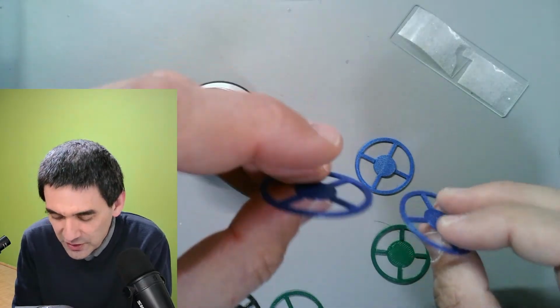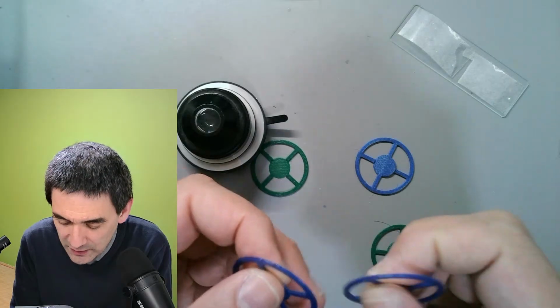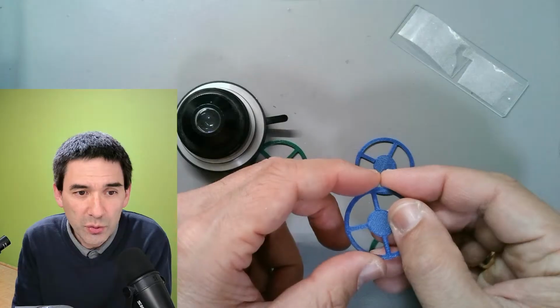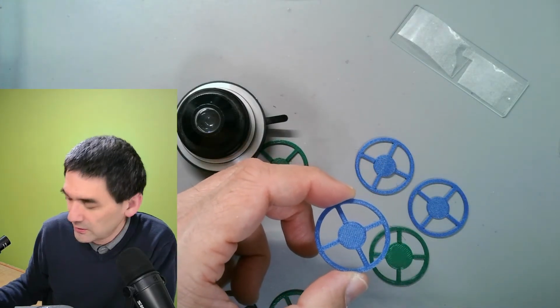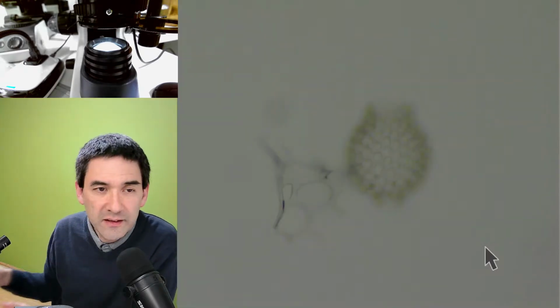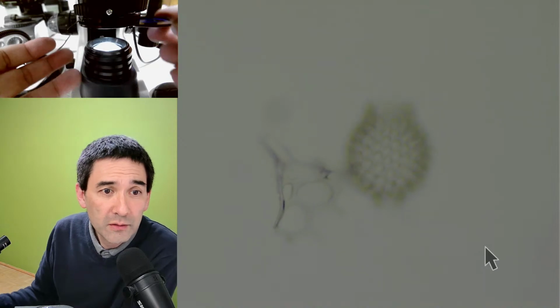Okay, but I just want to show you now. I need to choose a very thin one. I think this one is fairly thin. Let's try this here, and I just want to show you how this one looks, because the blue color in oblique illumination unfortunately does not have a huge effect. Okay, so I'm going to put in this blue filter here, right?